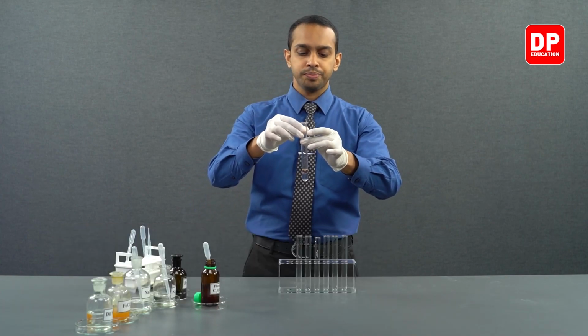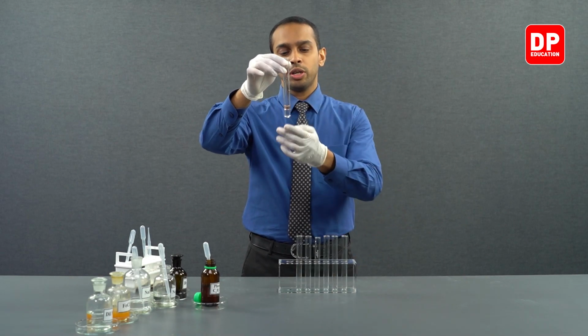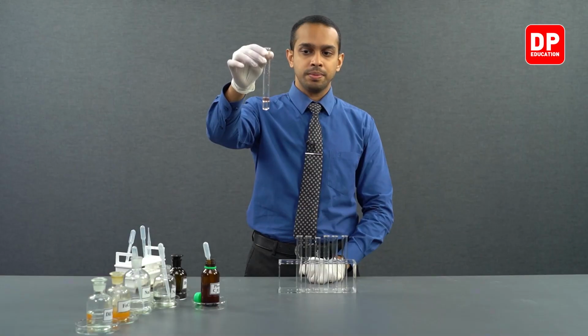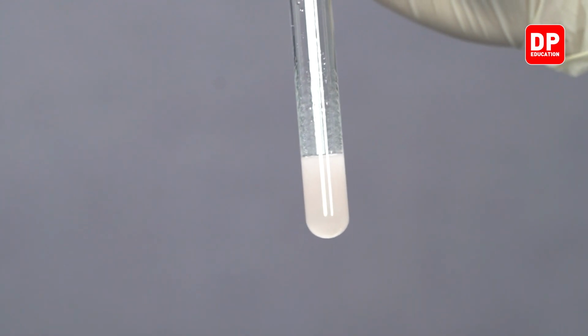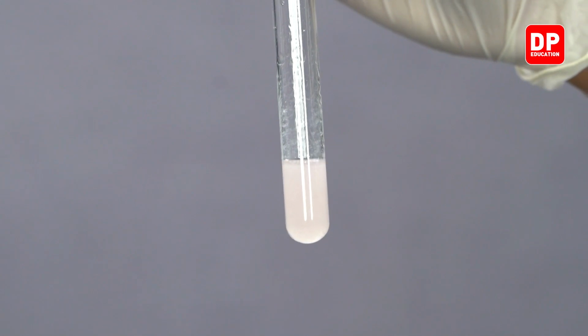As you can see, upon addition of phenol into our sodium carbonate solution, they did not mix. There is a clear layer separation, and if you mix it a little bit, you will see some amount of phenol will dissolve in the aqueous medium like we have observed before, but we do not see evolution of a gas.